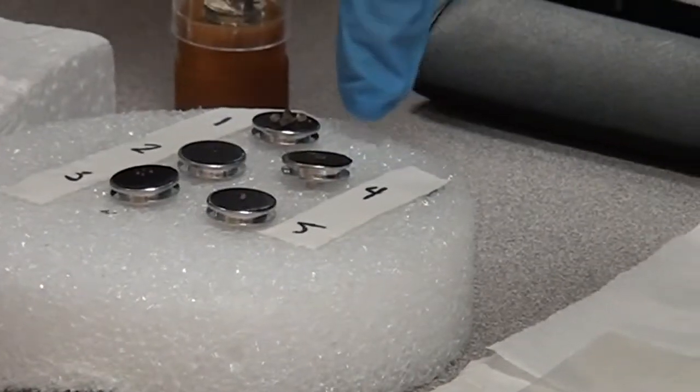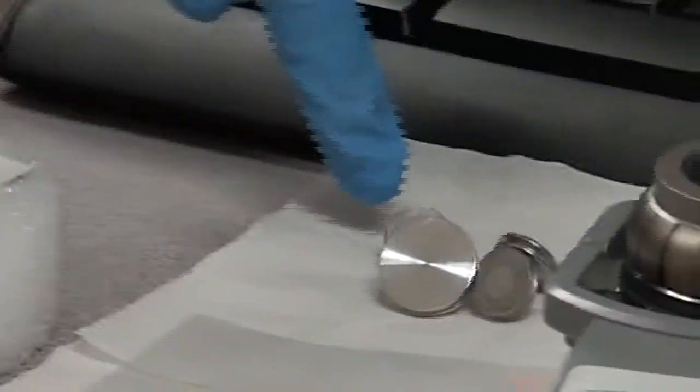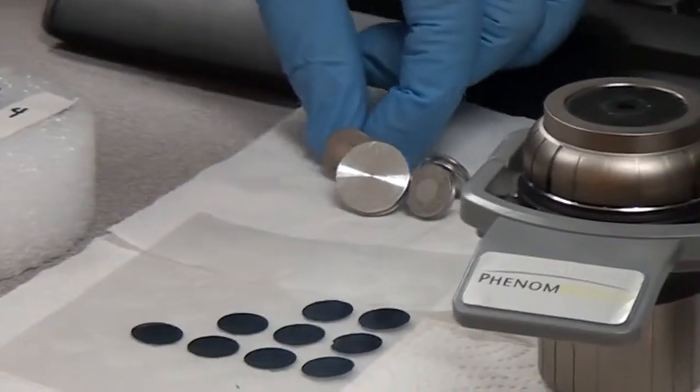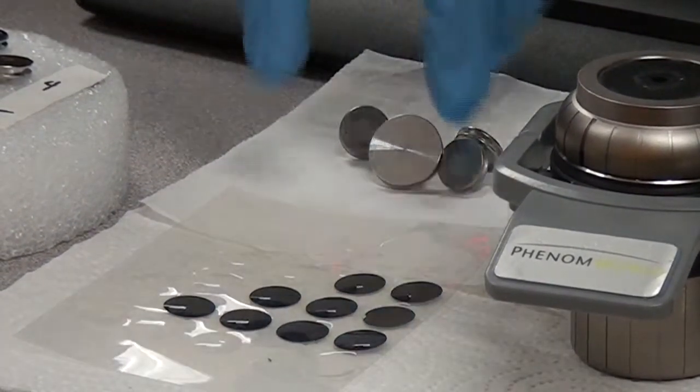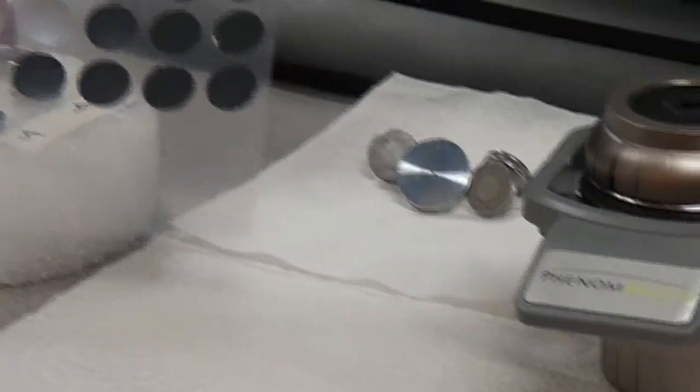hot plates, or ovens. Then they must be mounted on a metal stub, usually aluminum. The sample must be made conductive, for example by using adhesive carbon tape.